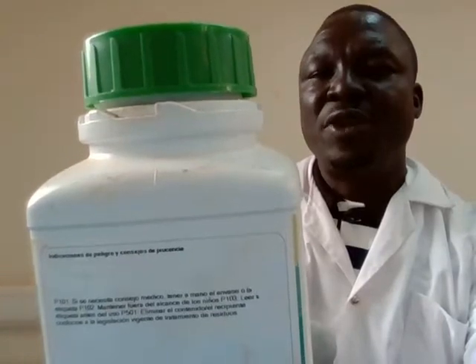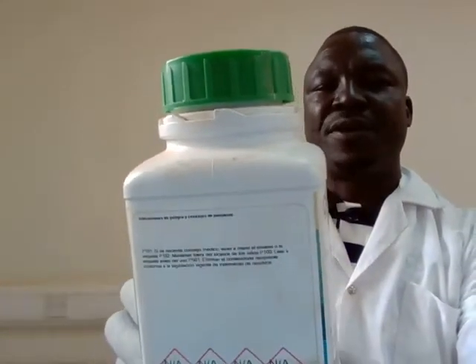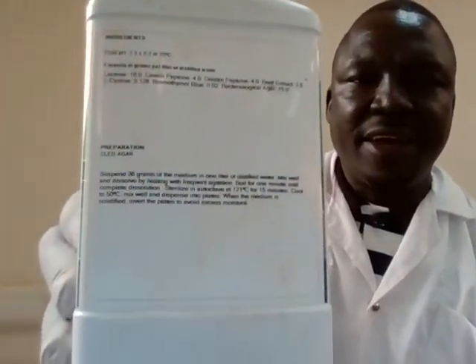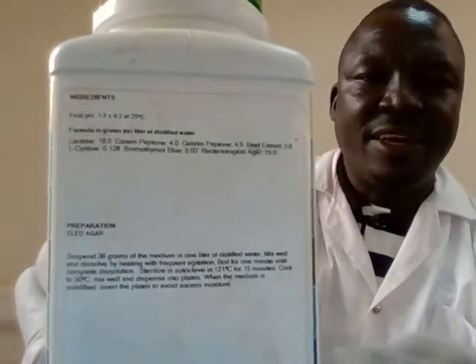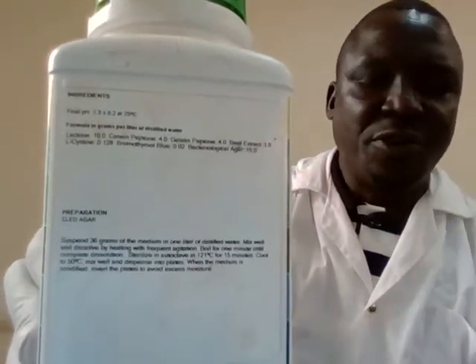So you can find the language that you understand most. You might find it in German, you might find it in English. So for us here, we're using English. So as cleared, you can see the procedure here, down here. So you read that carefully and you see what makes you understand how much you should weigh and dissolve in which volume of distilled water.